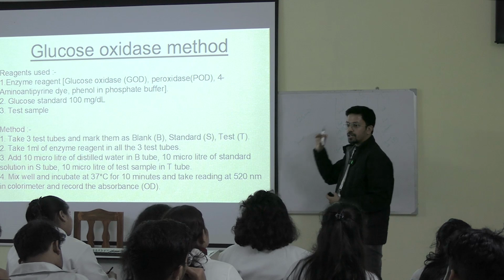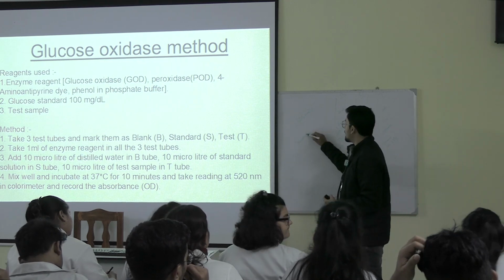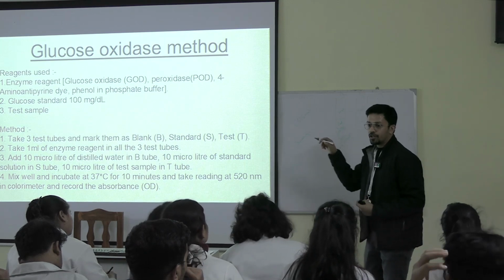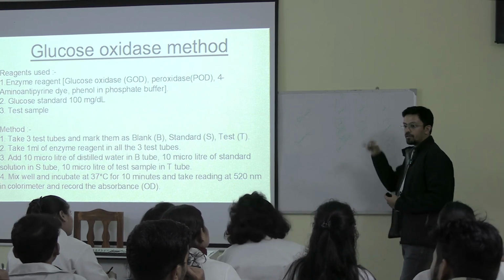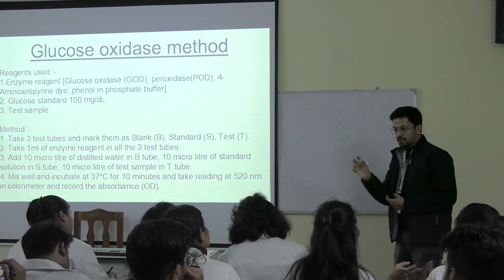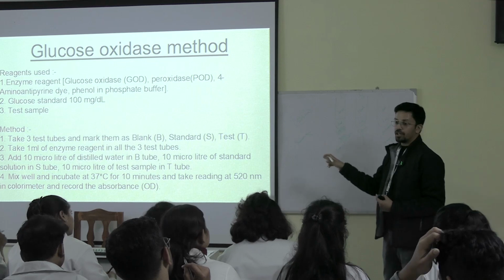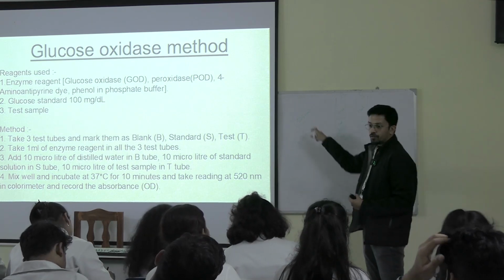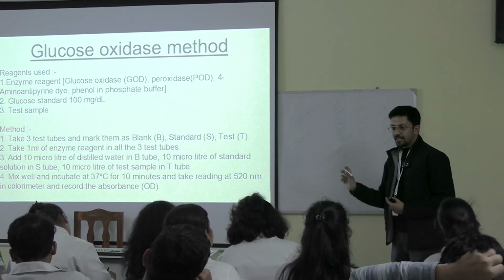So over there, that color coded sample you are putting into the machine, and then you are estimating the lambda at multiple wavelengths like 400 nanometer, 440 nanometer, 450, 500, 520, 540. Everywhere you are measuring. Then whatever you are getting on the screen, that is the absorbance, that is the OD. Whichever OD is the maximum, at whichever wavelength, that is your lambda max. And the values that you are getting, that is the absorbance.